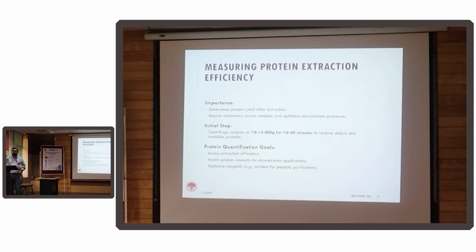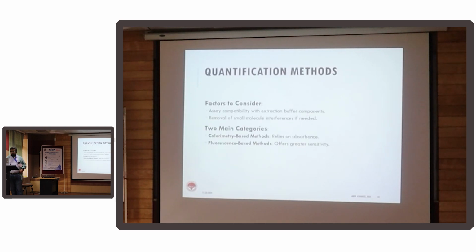So you have to really, please, do follow this. Extraction efficiency is, sometimes you can use a sonicator, sometimes you will use a Dounce homogenizer. Even that part you can standardize. Which one is getting more protein yield for your sample, so lots of standardizations to consider.